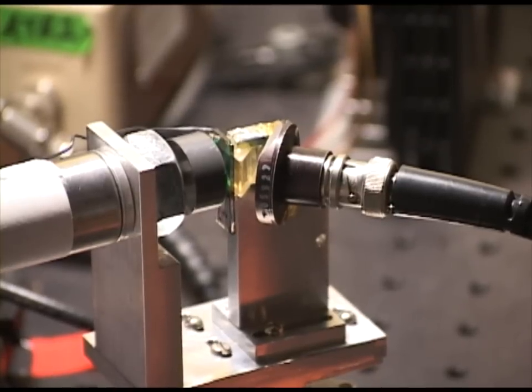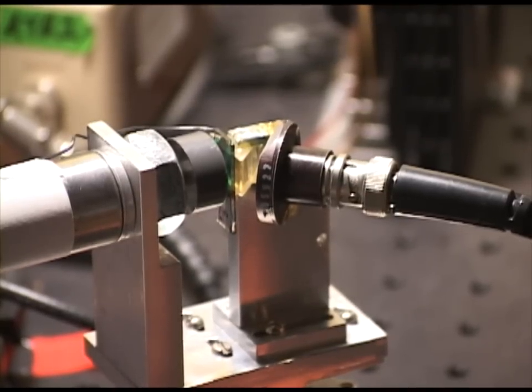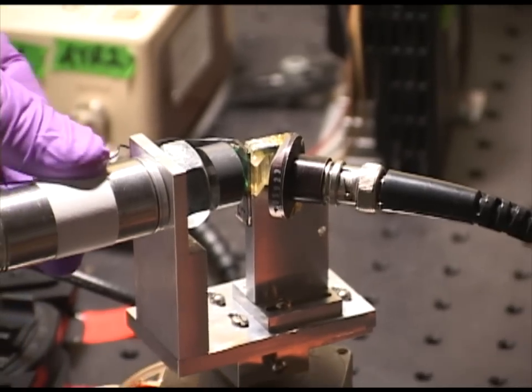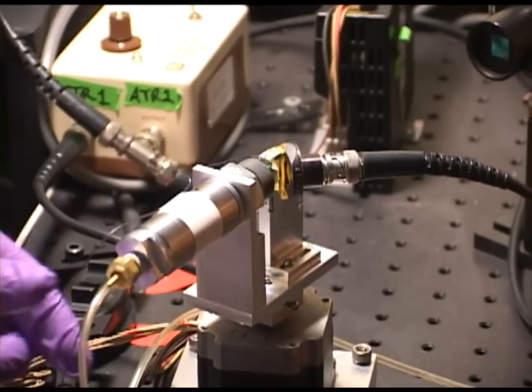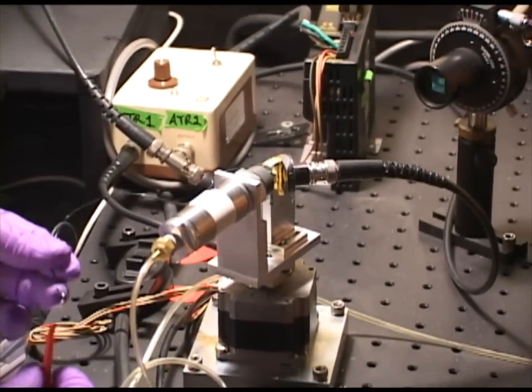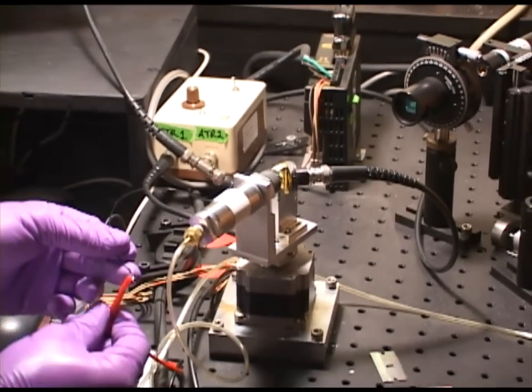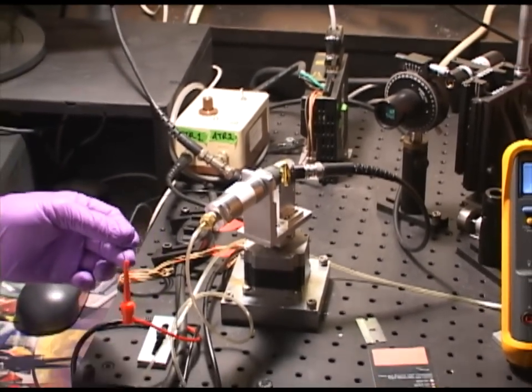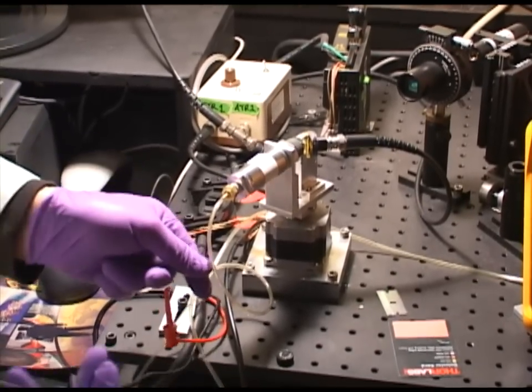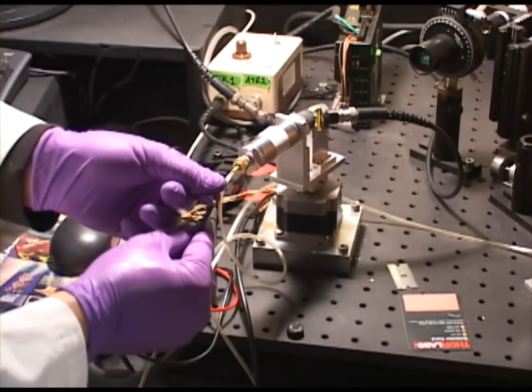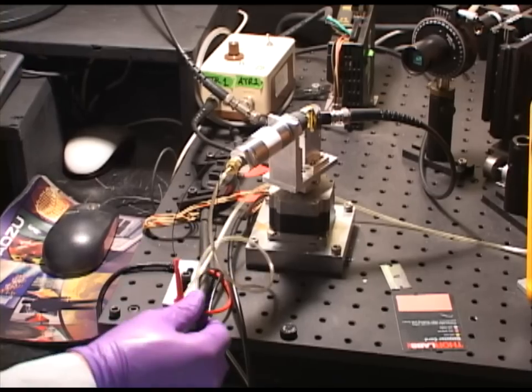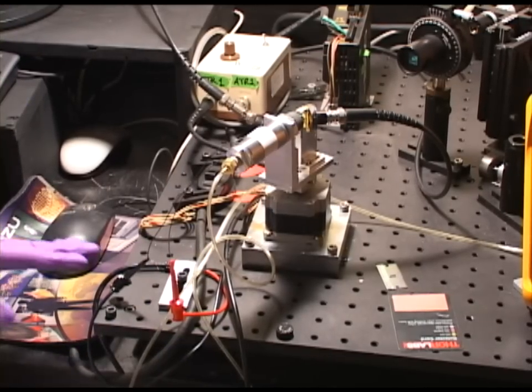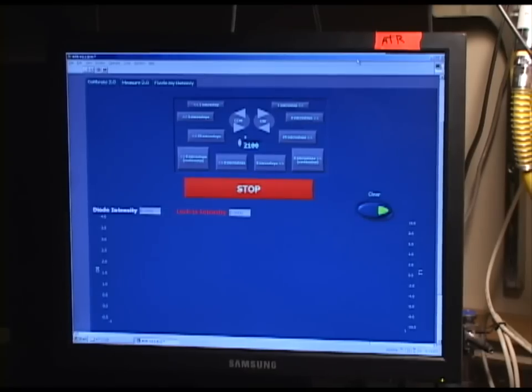Once the sample has been aligned and a proper wet spot is obtained, we now connect the wires leading from the gold electrode and ITO to these clips here. In this case, the bias is not important, so either wire can be connected to the red lead.